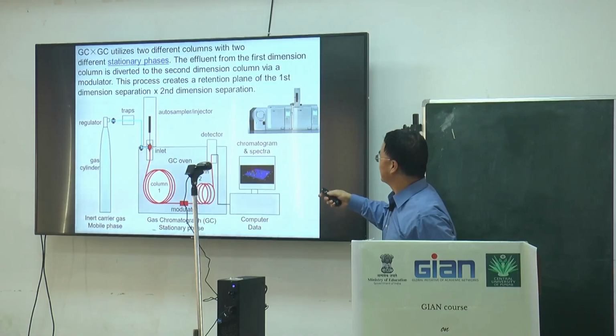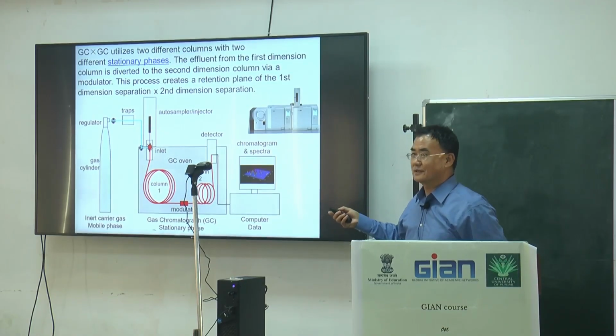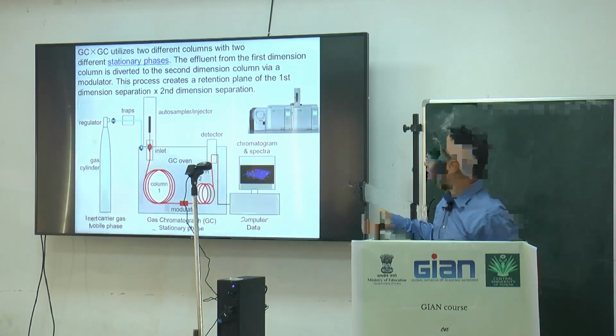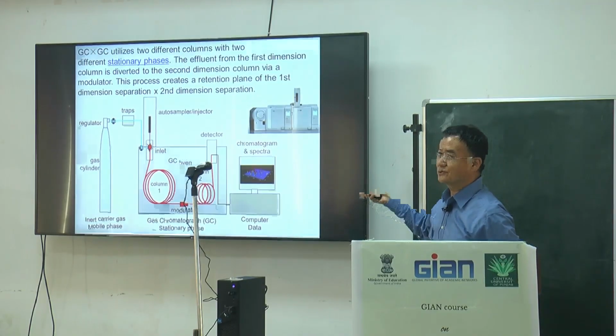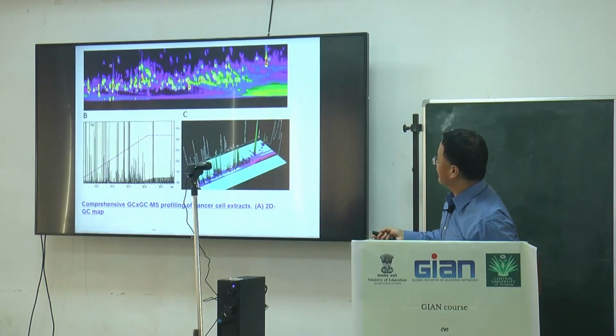So this way increases the accuracy, and it can also do quantitative analysis.